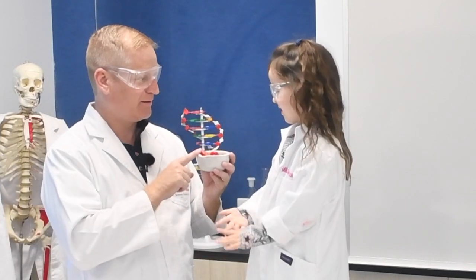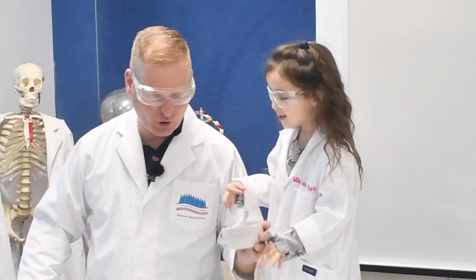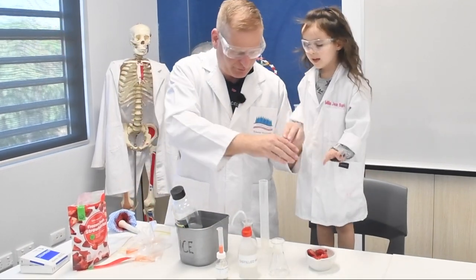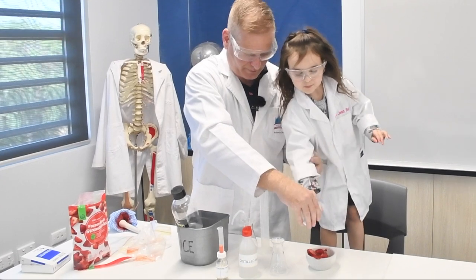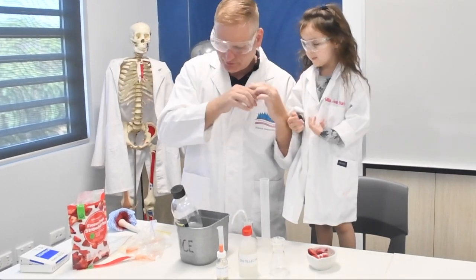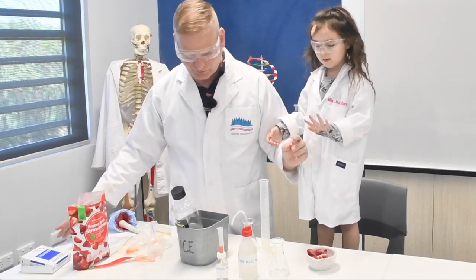So, mortar and pestle. We need to grind up. Can I do it? You can, but first we need to put salt in. Because salt helps, being abrasive. Can I just a little bit of salt. So that's an abrasive, so it helps grind up those cell walls and cell membranes.